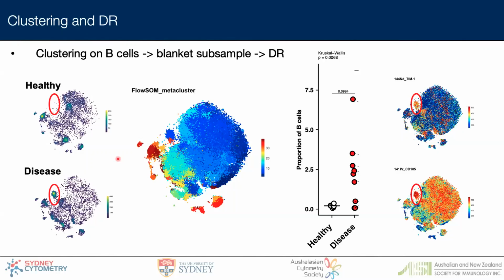As I said, at spotting the difference, computers are better. The other aspect here is the parameter choices that I set. So maybe I needed to optimize the tSNE plots a bit more, or optimize the clustering as well, and use a more appropriate clustering algorithm. But even at the subsampling level, there is always the possibility that when I subsampled the data, it was just by chance that none of the healthy cells from this population were included, which is why it looks this way.